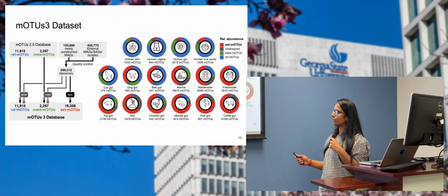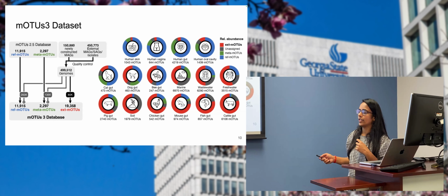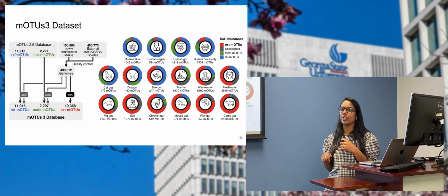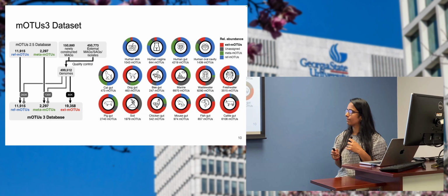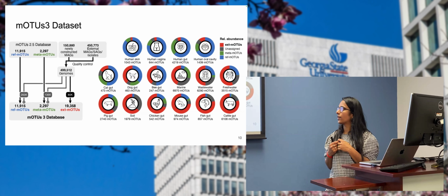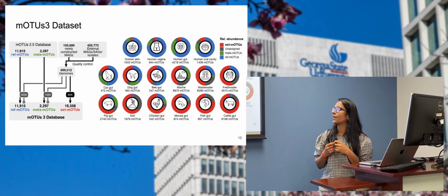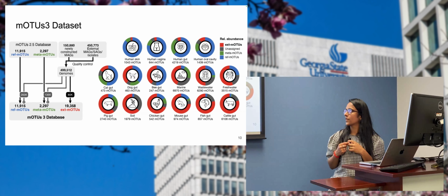That is de novo. But in this single amplified genome, it's isolated, and isolated means all reads come from the same genome. So it's okay to align or assemble them together. The MAG has too many species, and each read belongs to a different one, so we try to attach them together.